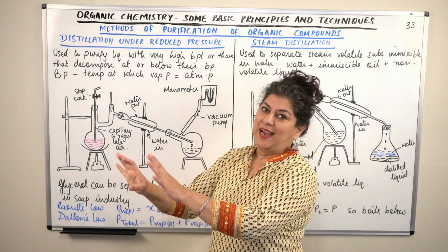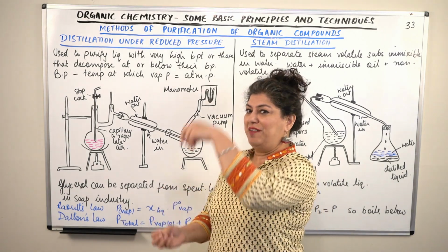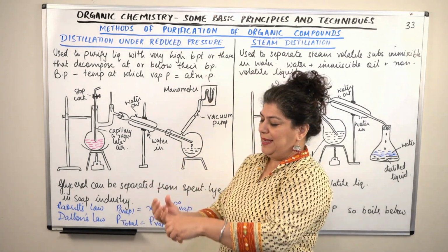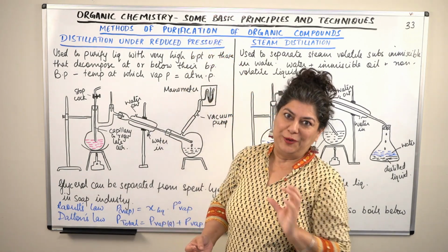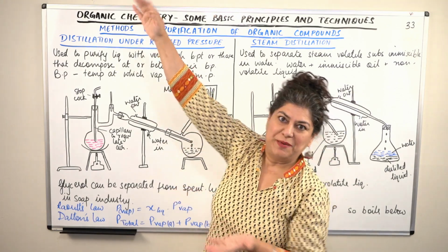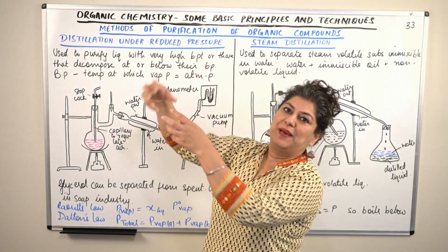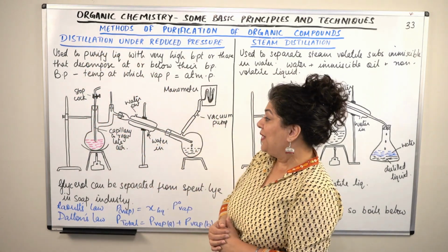Simple distillation is the actual distillation. Fractional distillation was the smarter version where we repeated the distillation by increasing the length of the column, so that the vapors, as they rise, the different fractions keep separating out. And as the vapors rise, they keep cooling down and we keep getting the different condensed fractions.